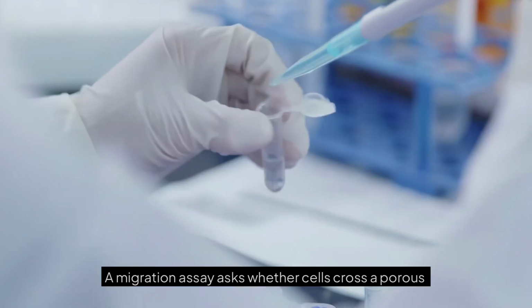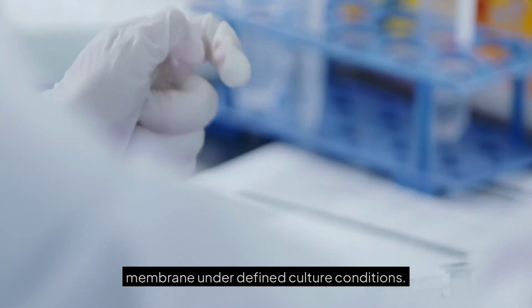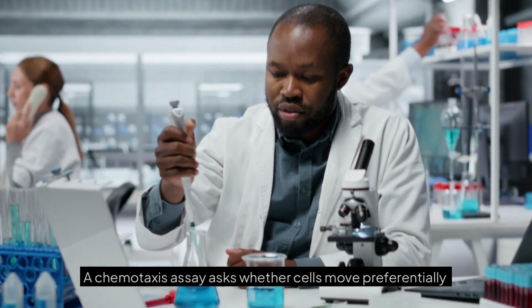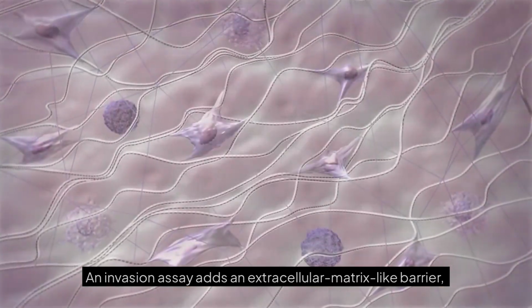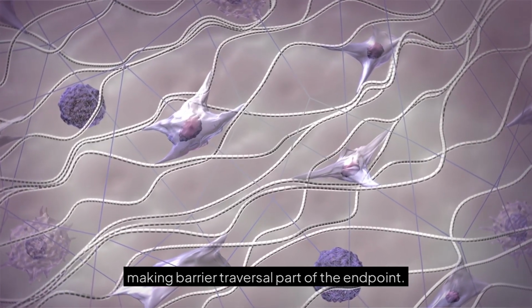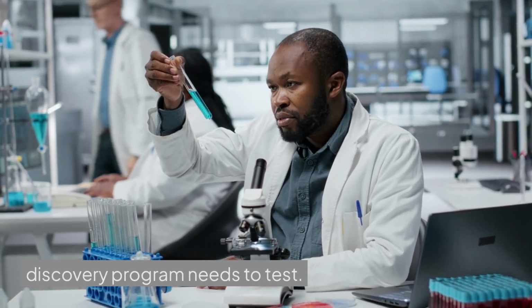A migration assay asks whether cells cross a porous membrane under defined culture conditions. A chemotaxis assay asks whether cells move preferentially toward a chemical signal, following a concentration gradient. An invasion assay adds an extracellular-matrix-like barrier, making barrier traversal part of the endpoint. The correct format begins with the claim the discovery program needs to test.